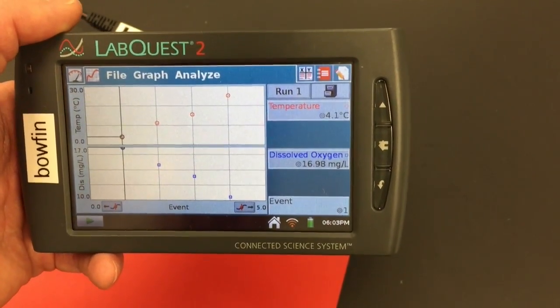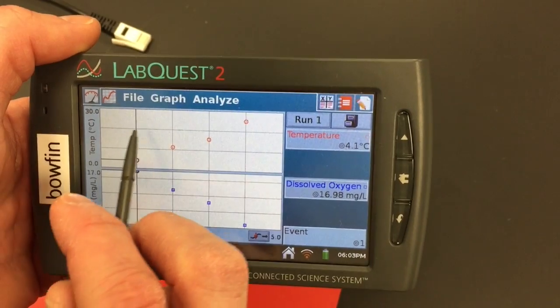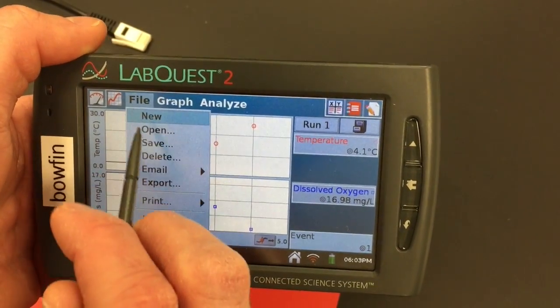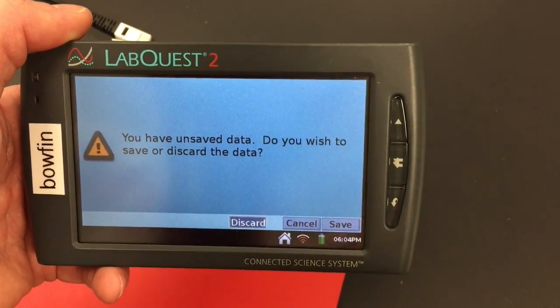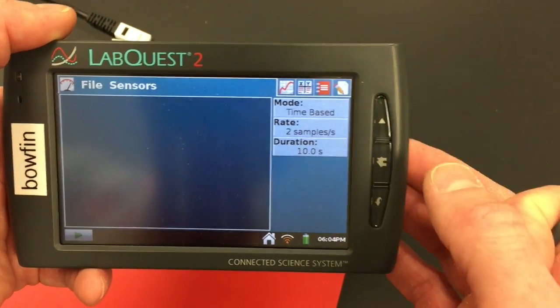Last thing to do is to shut down the LabQuest device. If you want to delete your data and clear it off the device, just go File New when you're all done, and discard, that'll basically reset the LabQuest for the next person.